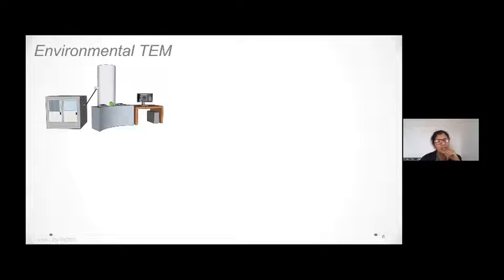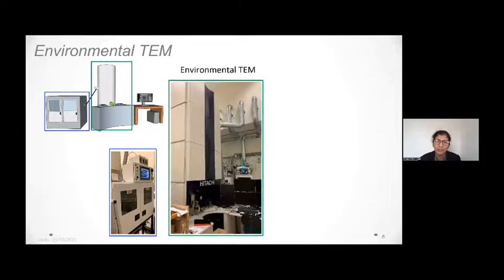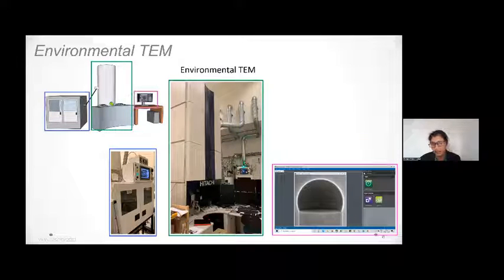So this is just a schematic of the system that we had, where there is a section for mixing the gases, where the sources should be at the required temperature and pressure, with controlled flows going into the microscope. We have a Hitachi environmental TEM, and we view this on a screen and look when the wire is growing.